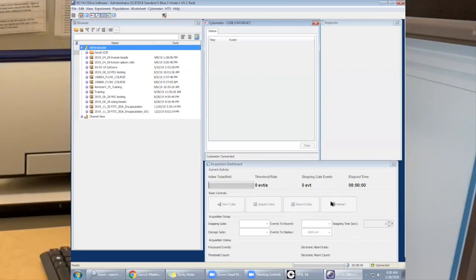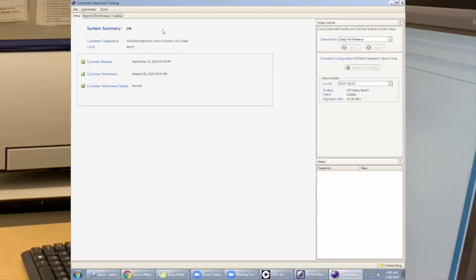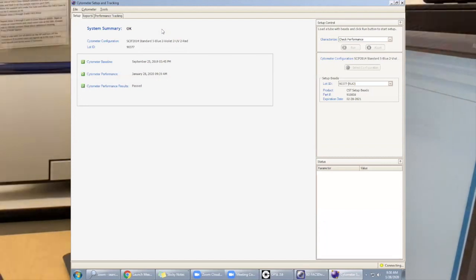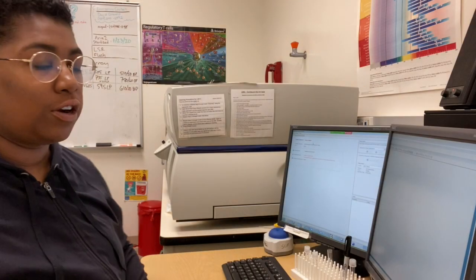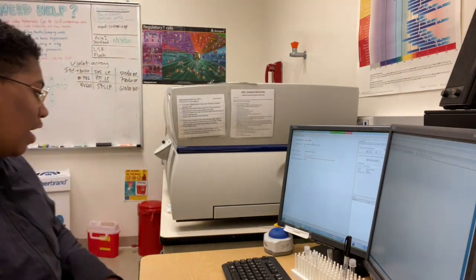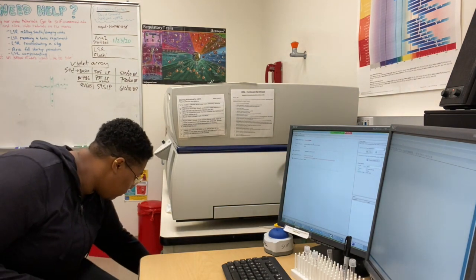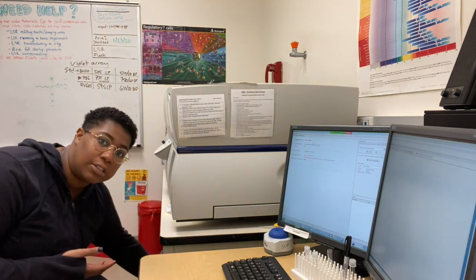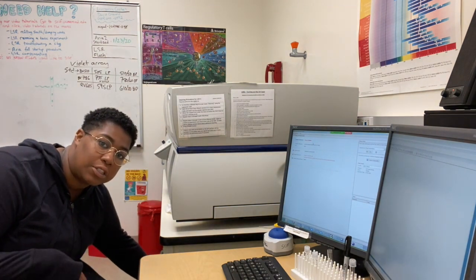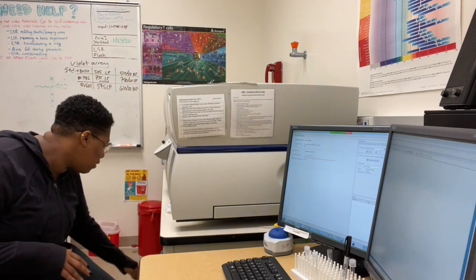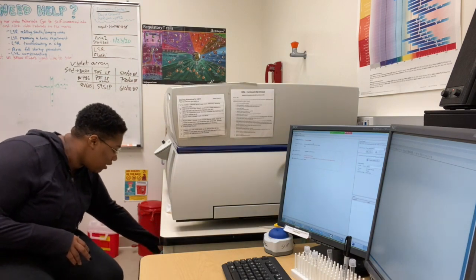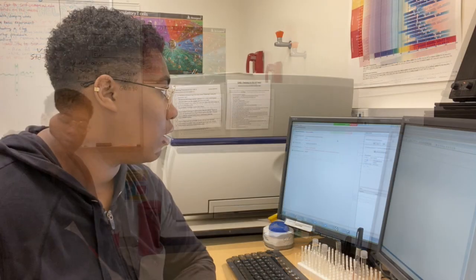Go into Cytometer, press CST, and the screen will come up. Before you run CST, you want to make sure that you have enough sheath fluid. This is running empty, so I'm going to refill it. And you want to make sure that the bleach is not full.